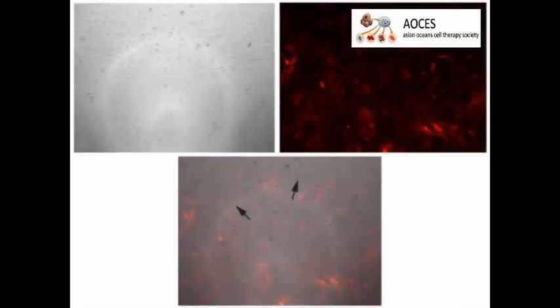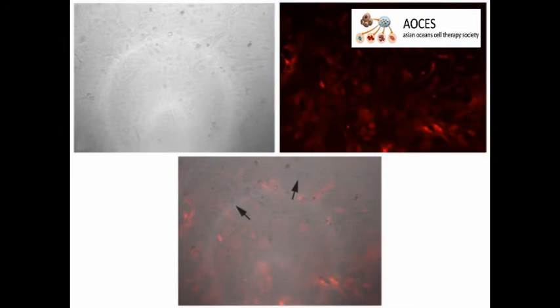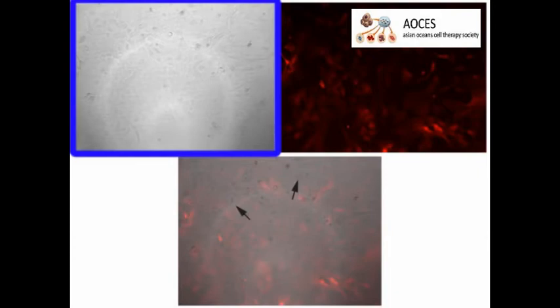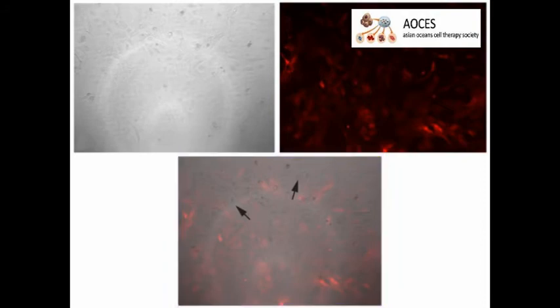Due to the properties of the lentiviral particles used in this study, when such nasal epithelial cells are transduced, they express the tdTomato fluorescent marker, as demonstrated by the upper right image of cells 4 days post-transduction. A comparison with the corresponding bright field picture reveals that not every cell demonstrates tdTomato signal, as evidenced by the merged image on the bottom. Thus, not every cell is transduced. However, transduction efficiency is approximately 90%.